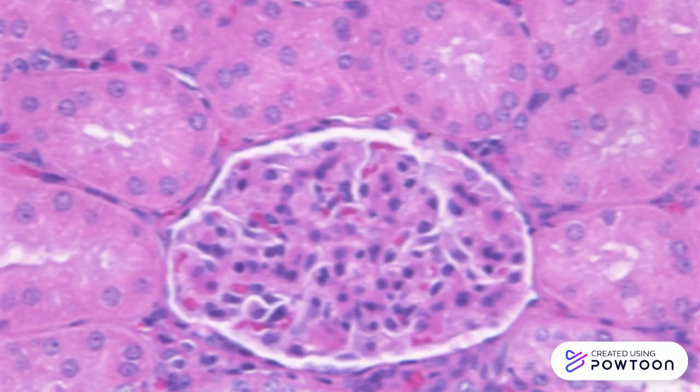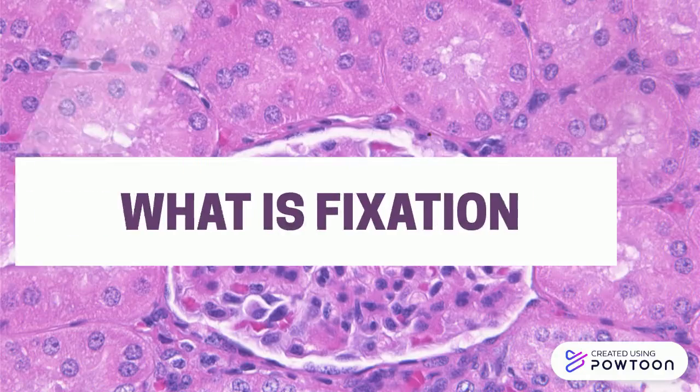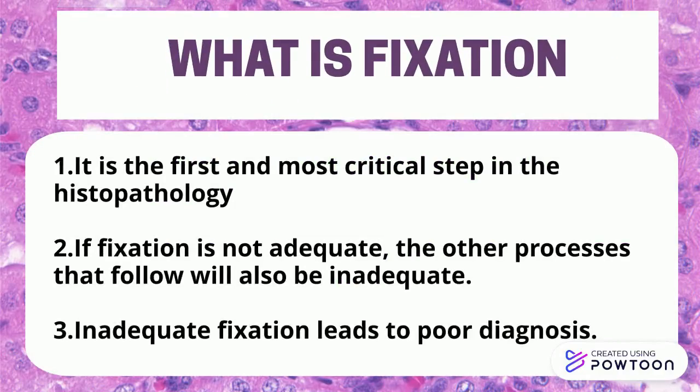The first and most critical step in histotechnology, fixation. Fixation is a process that preserves tissues from decay, thereby preventing autolysis or putrefaction. If fixation is not adequate, the other processes that follow, such as dehydration, clearing, infiltration, embedding, microtomy, and staining will also be inadequate. A poorly processed tissue will make it difficult for the pathologist to render a proper diagnosis.